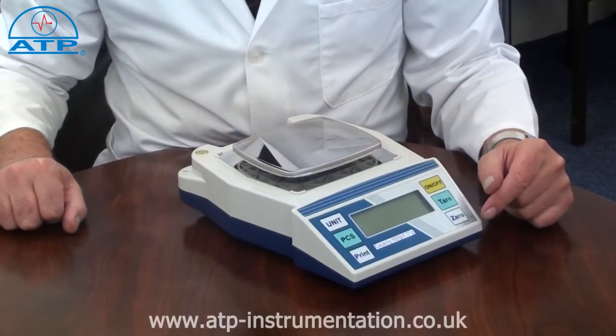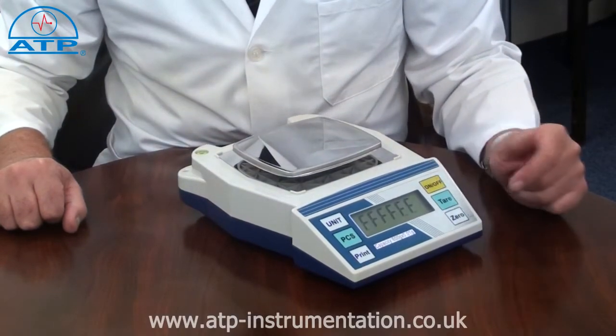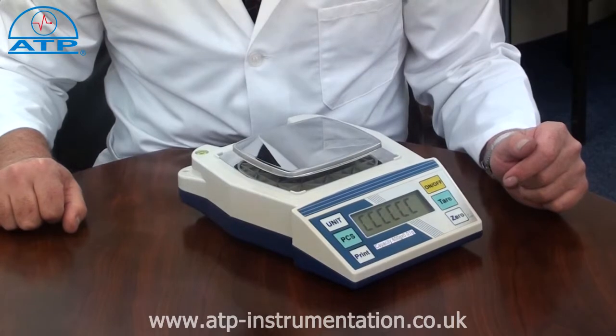Overload is to twice the capacity and has a visual and audible alarm should the scale's capacity be exceeded. On start-up, the scale will go through a self-verification program to ensure all the functions are working correctly.